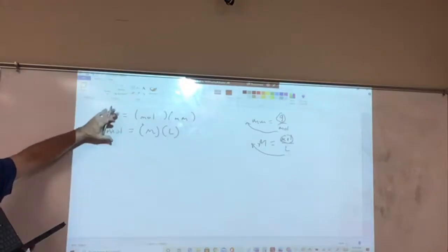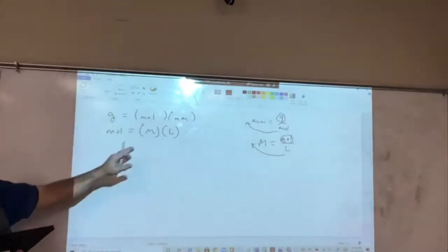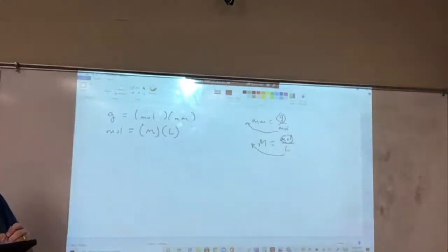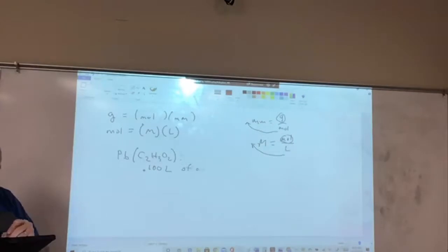And that means that I'm going to have to give you the type of solution I want you to create. I'm going to have to say, for lead acetate, I want you to create 0.100 liters of a 0.1 molar solution.